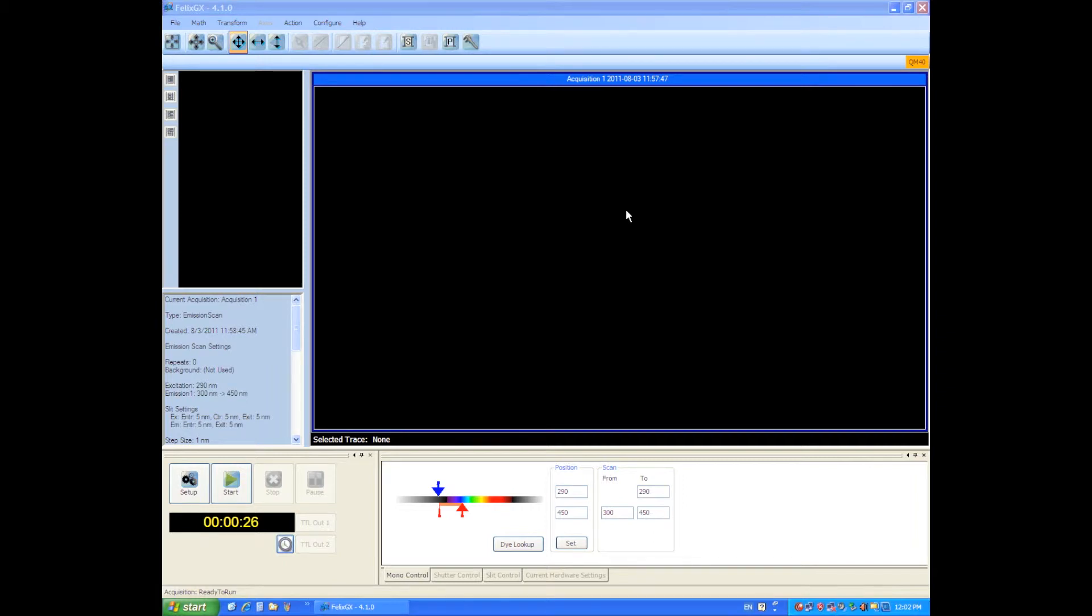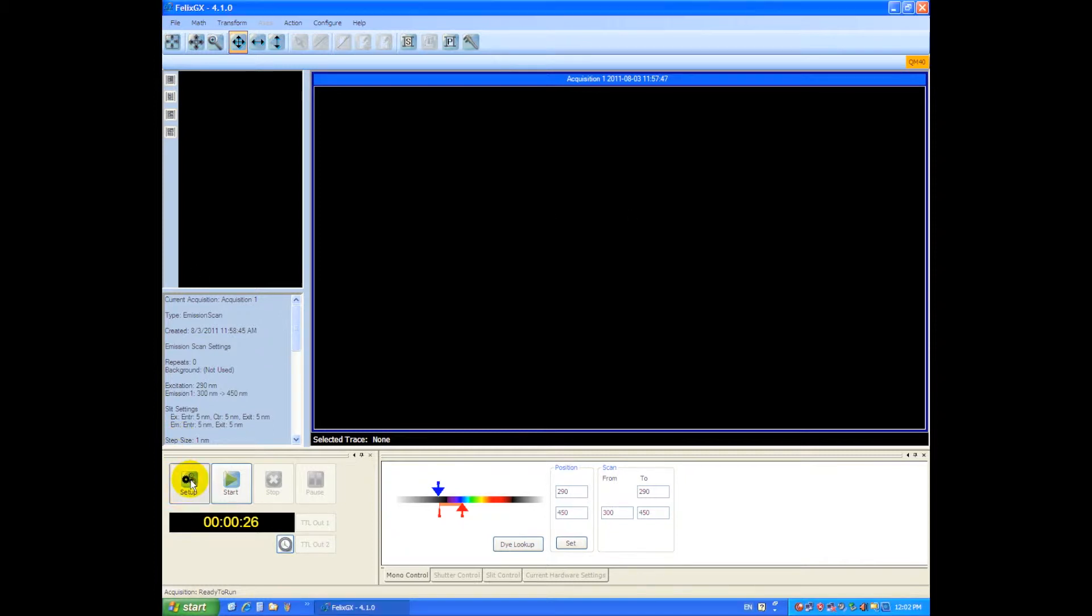All right, welcome back everyone. I'm going to show you how to do a scan after we've configured the instrument. We just go down here and click on this setup button.